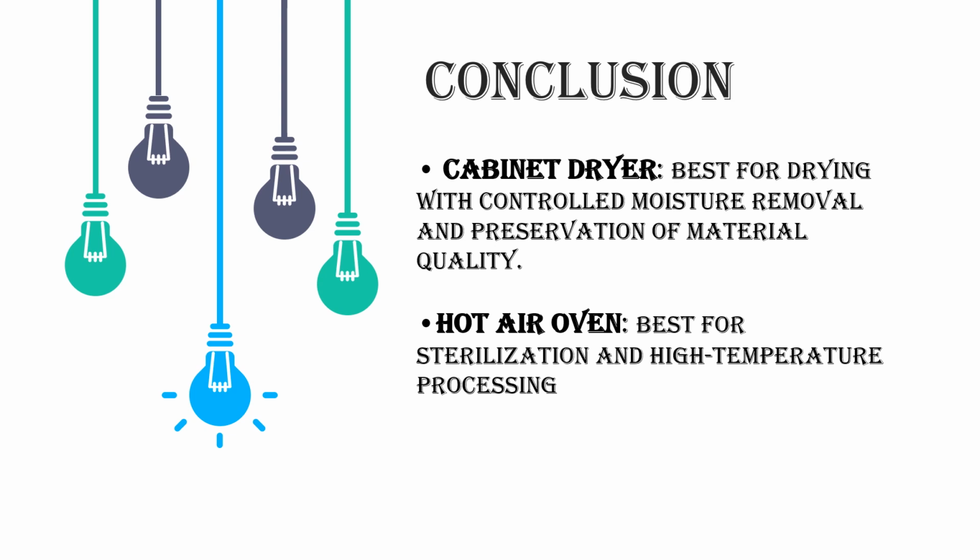So when we compare all these things, cabinet dryer is a better option when compared to hot air oven.